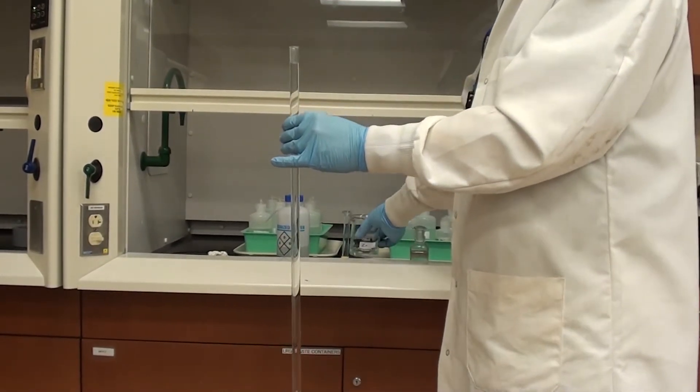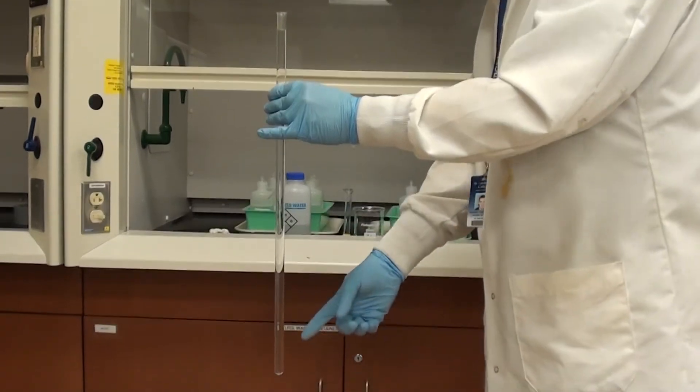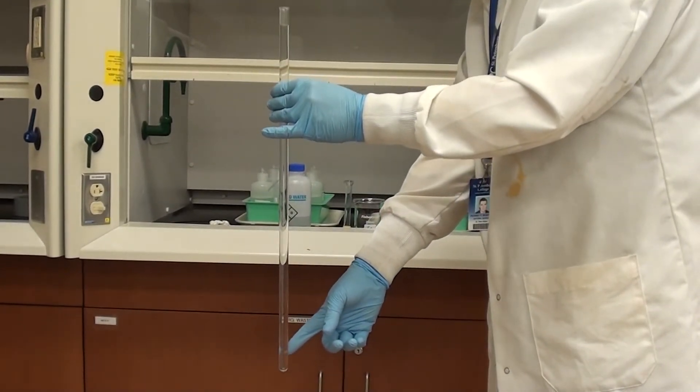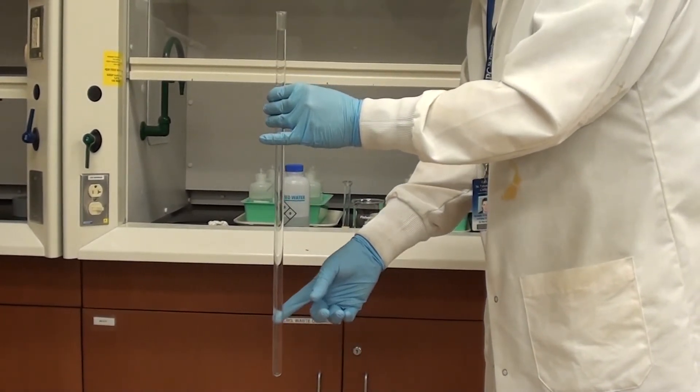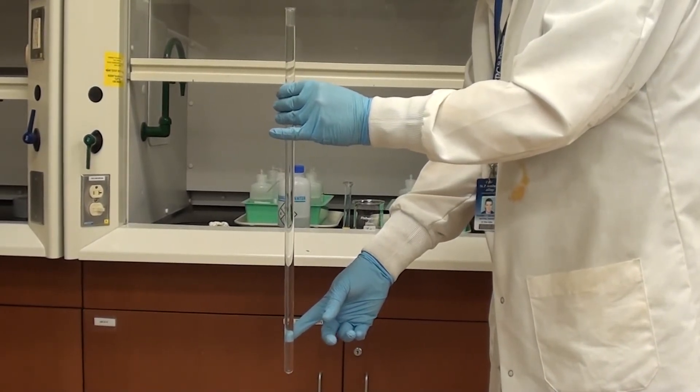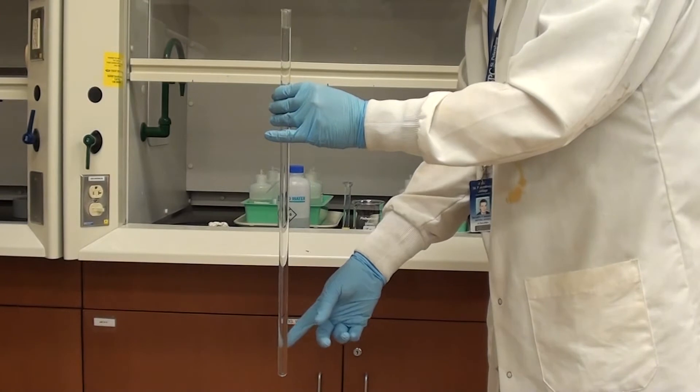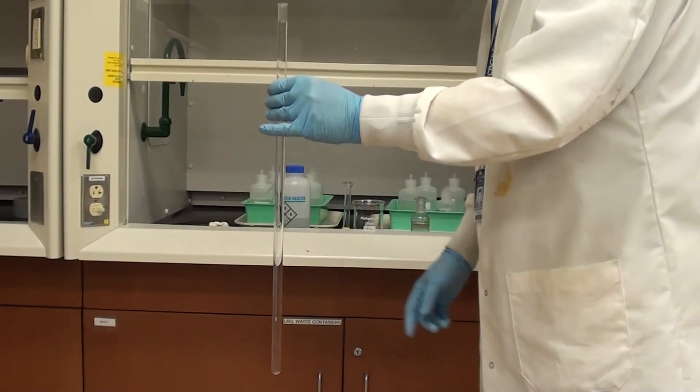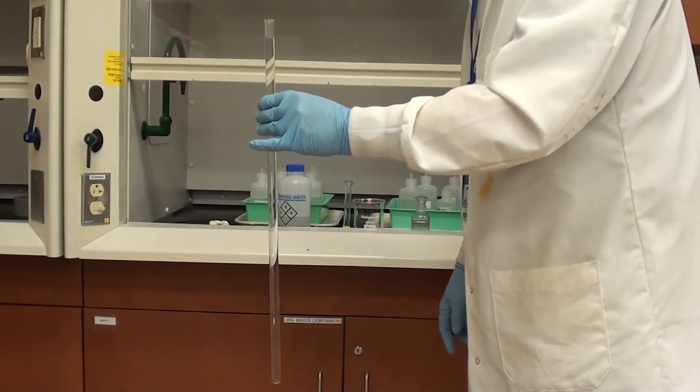So that should do it. Now what I want you to see here is you can kind of see the layer. You've got the HCl on the bottom, you've got the water on the top and there's the, it's not really a phase separation per se but you can see that there is a separation between the two. And that's exactly what we're looking for for the next step.